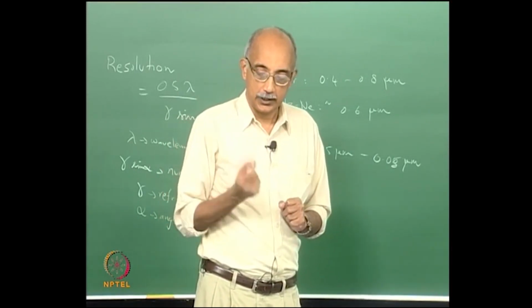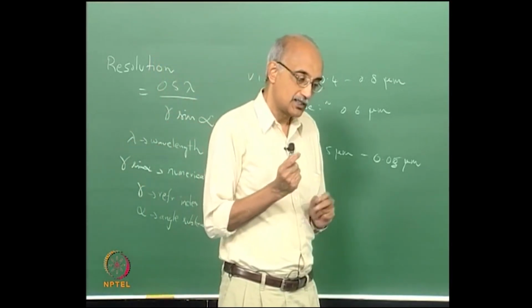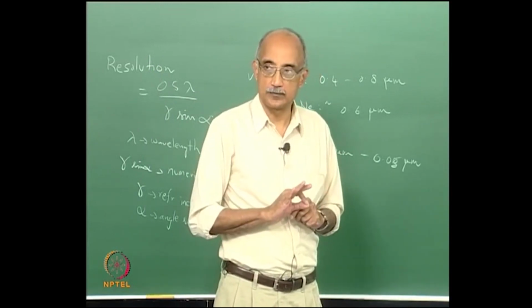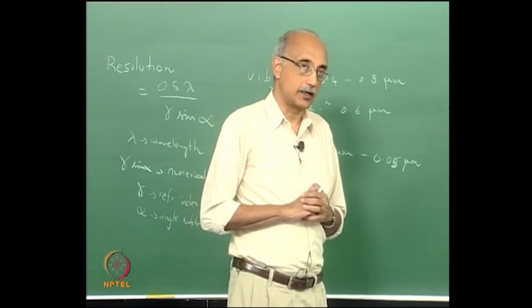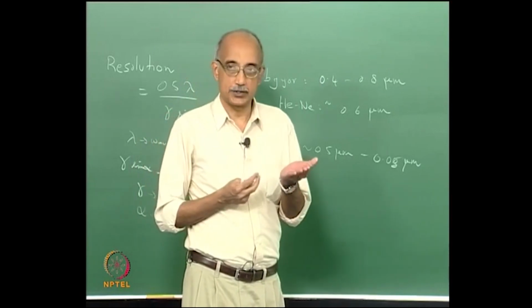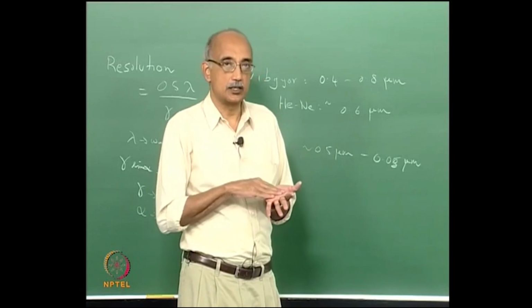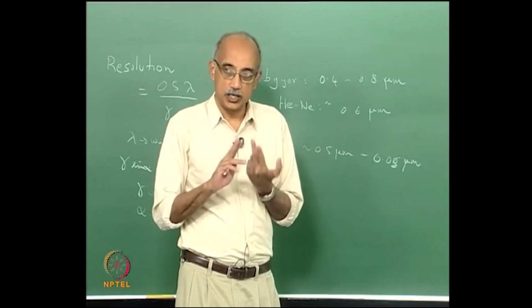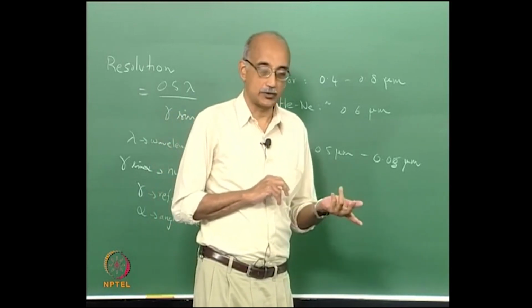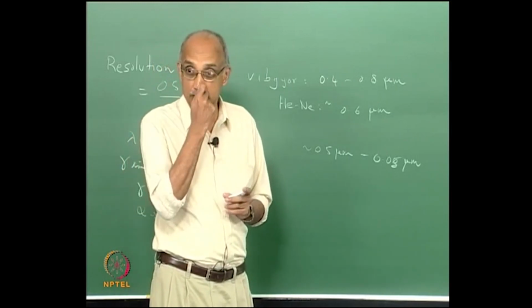Now that technique works well for the most part if there is a clear delineation between a surface defect and a surface particle. In many applications you may not care, but sometimes you do. You want to know whether something that you see on the surface is actually a feature of the surface or whether it's actually something sticking on the surface. To be able to resolve between those two can actually be quite difficult, and dark field microscopy was introduced essentially to address this issue.